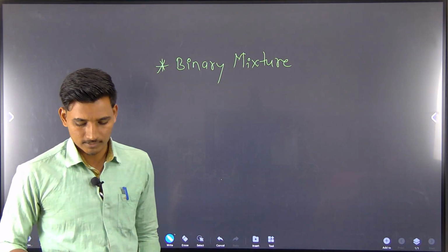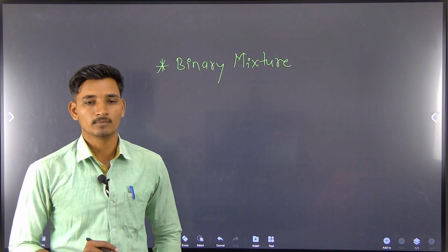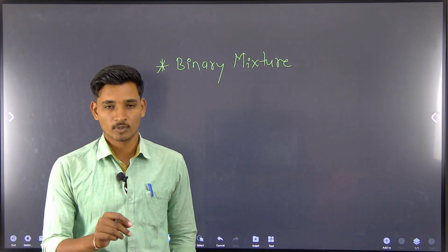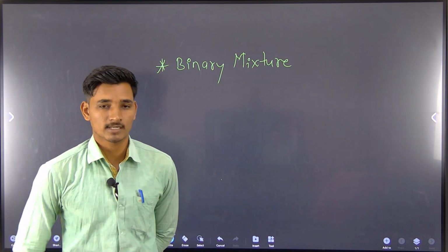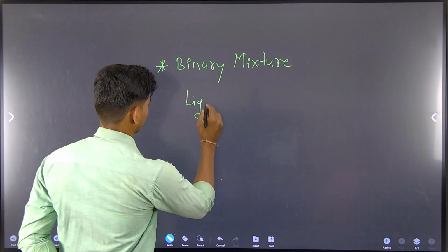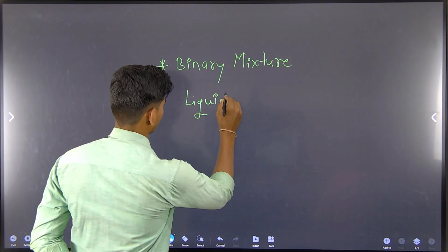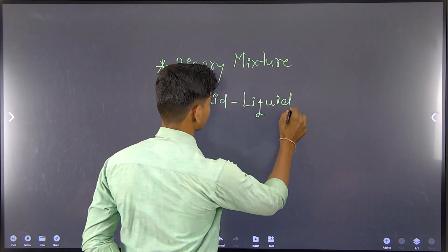We have already discussed in class how to separate the solid-liquid type and the solid type of binary mixture. In this lecture we are going to discuss how to separate the liquid type of binary mixture.